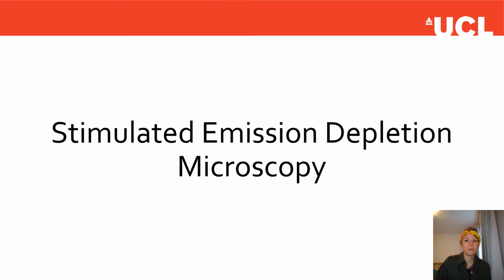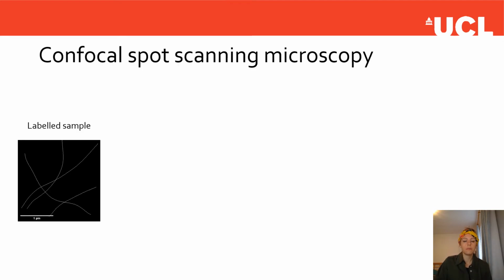Okay, so the next technique we're going to talk about is stimulated emission depletion microscopy, or STED. So STED is the only confocal super resolution microscopy technique of the main three. SIM and SMLM are both wide field, STED is confocal. So let's have a little refresher of confocal microscopy.